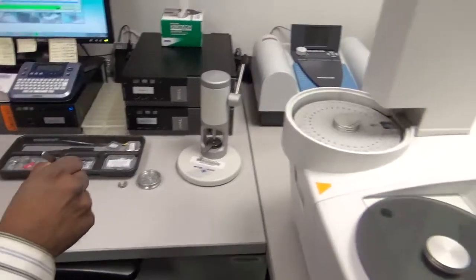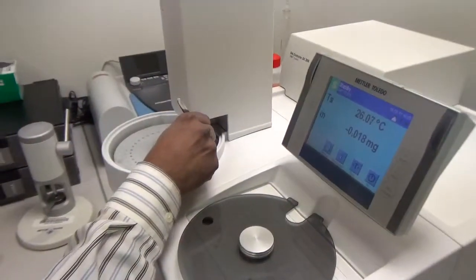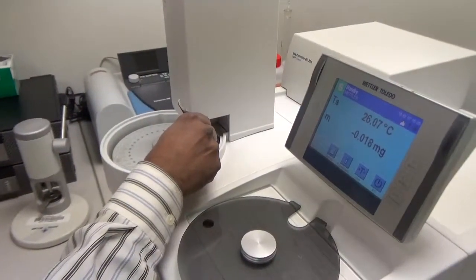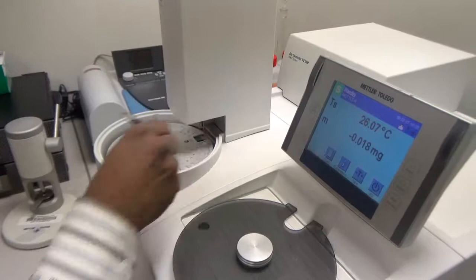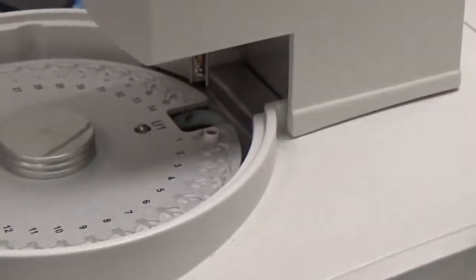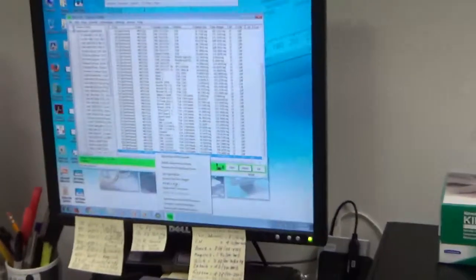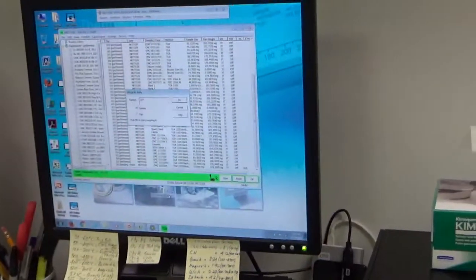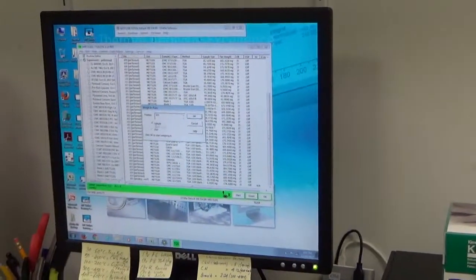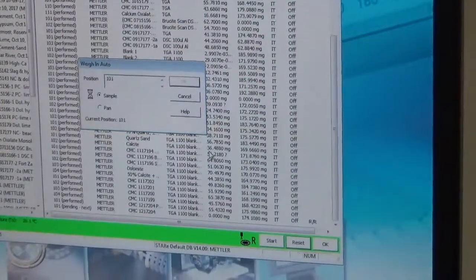Once the sample is loaded in the crucible, we place the sample and crucible in position 1 again at 101. We go to the row of the sample, right-click, 'weigh in auto.' Now it's going to take the weight of the sample. We say okay.